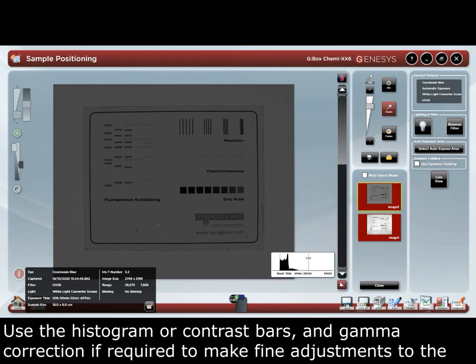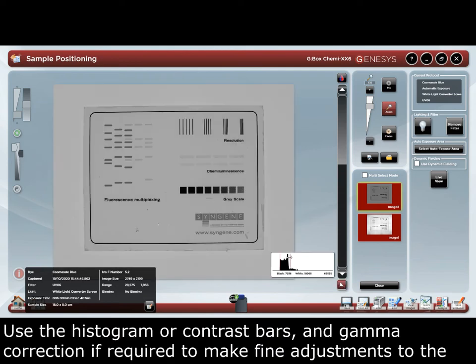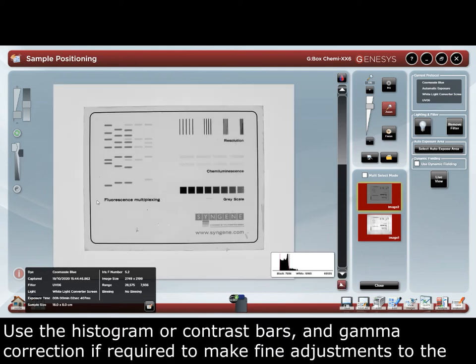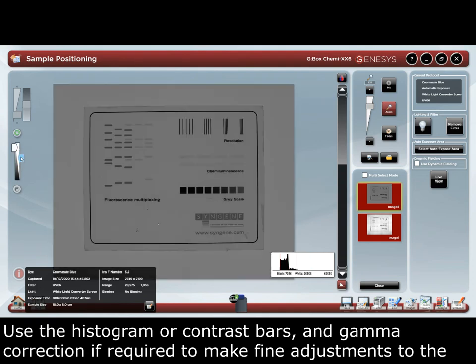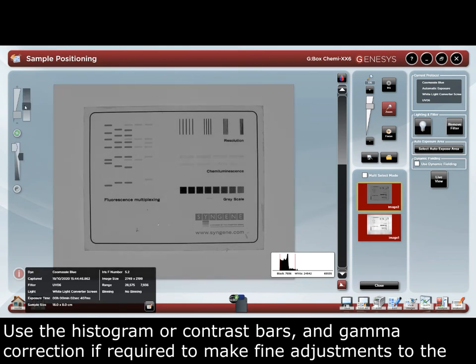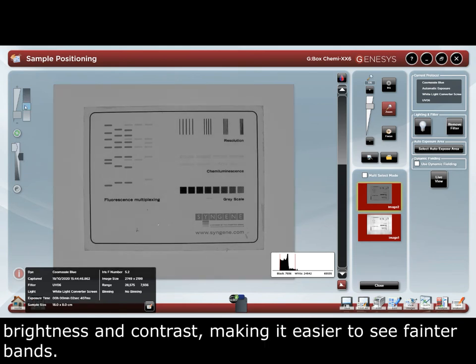Use the histogram or the contrast slider bars and gamma correction if required to make fine adjustments to the brightness and contrast, making it easier to see fainter bands.